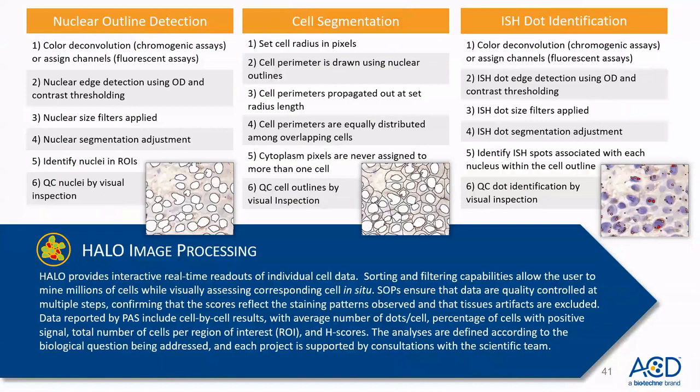One question that we often get is actually, can I subtract, perhaps using ImageJ, my DAPI image from my marker stain image? And the answer I usually give is no, because there will be slight differences from one slice to another when you're looking at FFPE tissue, for example. So it's always important to treat every single image as a unique project that needs special attention.